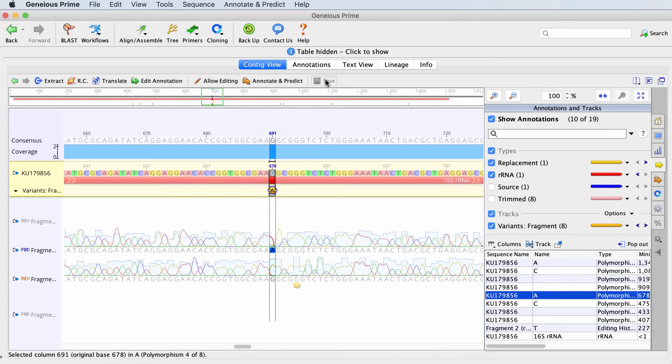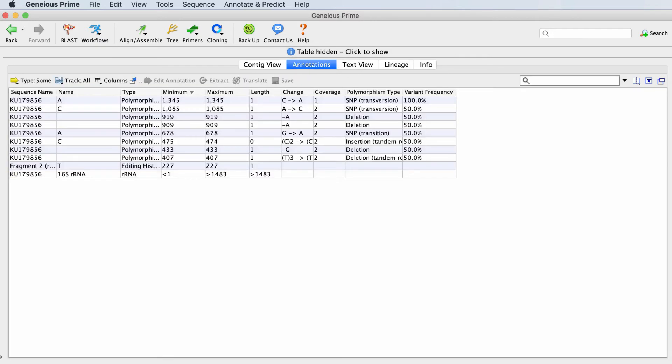To see this information in a table, click the Annotations tab. This will bring up a table of all of the annotations on your sequence.